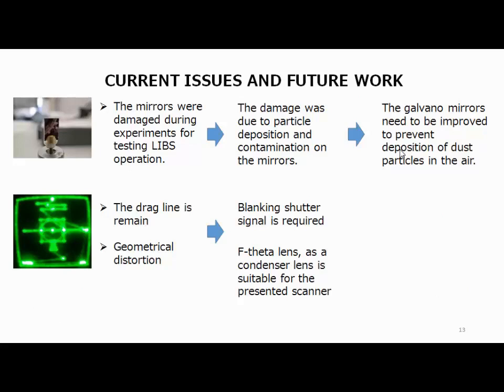Finally, I'd like to explain the current issues. The mirror was damaged during the experiment for testing LIBS operation. The damage was due to particle deposition and contamination on the mirrors. The mirror coating needs to be improved to prevent deposition of dust particles. Another issue is that the drag line artifact remains, so it is better to implement the blanking shutter signal. Additionally, geometrical distortion occurs, so to avoid this distortion, an f-theta lens is suitable for this scanner.